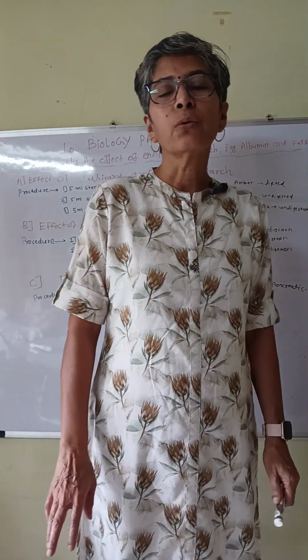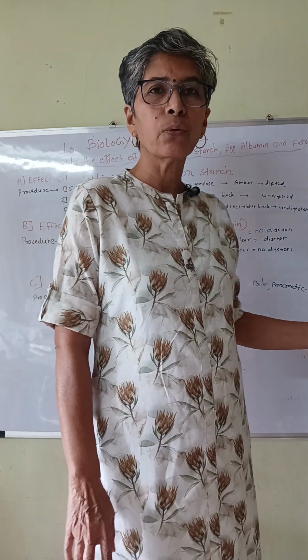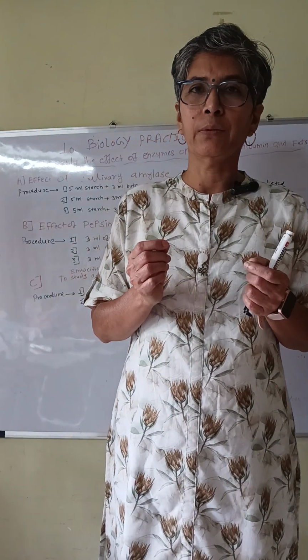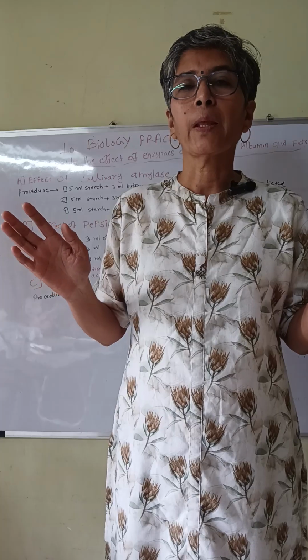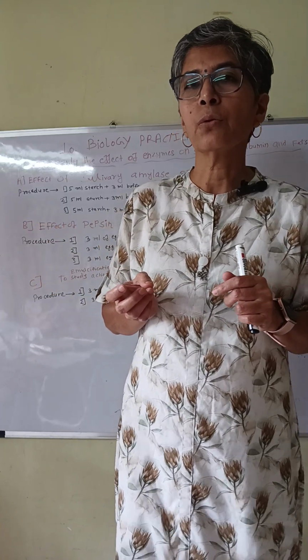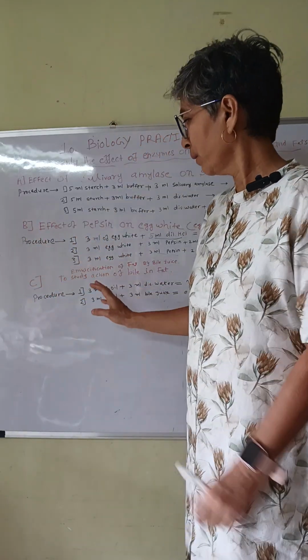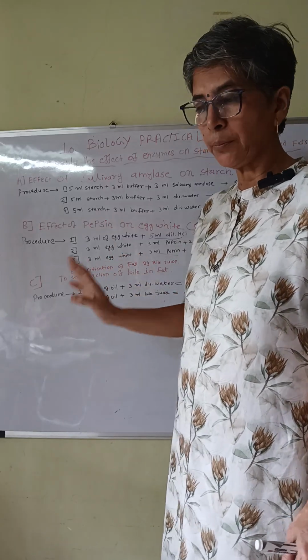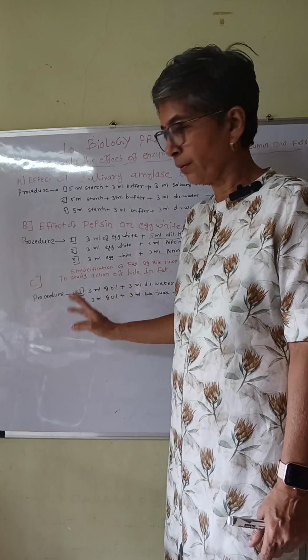Okay, so students, you know, emulsification is a process of breaking down liquid into tiny droplets. It prevents two separate layers of water and that liquid. Okay, so emulsification is necessary in our digestion of food. Okay, this is the principle for this activity of emulsification.